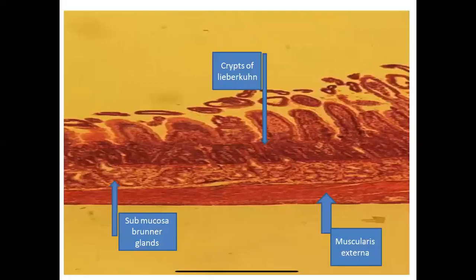الدودينم. اوكي at the duodenum راح اشوفك هذا السكشن. هنا عندنا from here to here it's the mucosa. هذه هي layer of the mucosa. لما نقول mucosa I mean it's including the lining epithelium with lamina propria with the muscularis interna or muscularis mucosa as we said it previously.